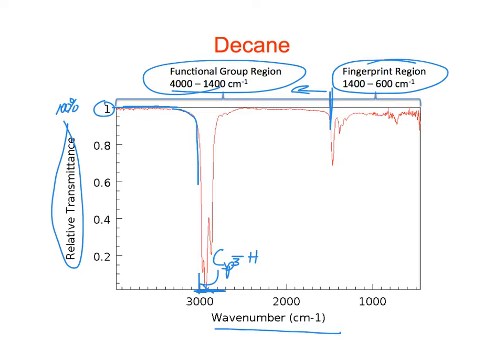With a little diamond tip one, you can run and not have to worry about concentration on most of the time. We'll see that more, I think, when we look at UV-vis spectra too. If it's too concentrated, then it gives a problem. So yeah, I guess you'd like to be able to see the tip of the peak.